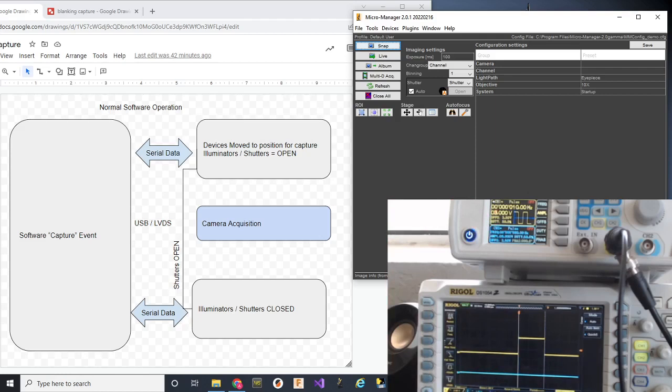this is a function generator and an oscilloscope. The oscilloscope, the yellow line, represents the output state of TTL1 on the TriggerScope. This would be if we had TTL running over to a LED illuminator.